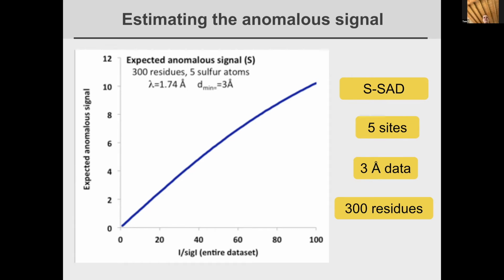And if your crystal doesn't diffract very well, then typically the anomalously scattering atoms are not ordered either. But there's no sure thing on that, and it'll be a little bit of an experiment to see whether it will work. So no guarantee on that one.